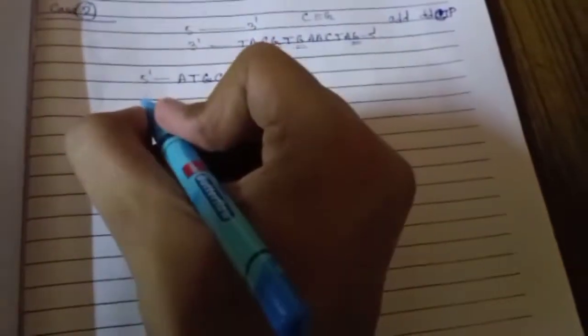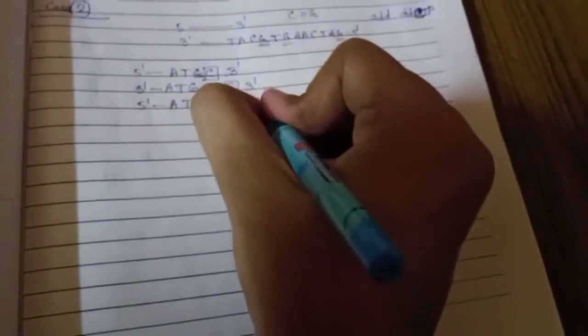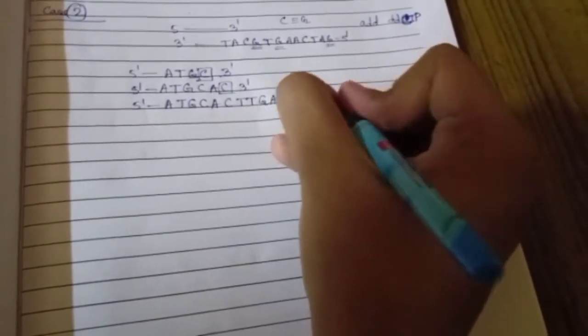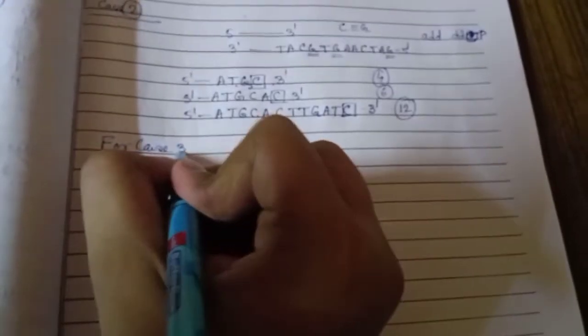So in this strand, where guanine is present, the cytosine terminates, and we will get fragments. By adding ddCTP, we will get 4 nucleotide fragments, 6 nucleotide fragments, and 12 nucleotide fragments. This is the size of the fragments.